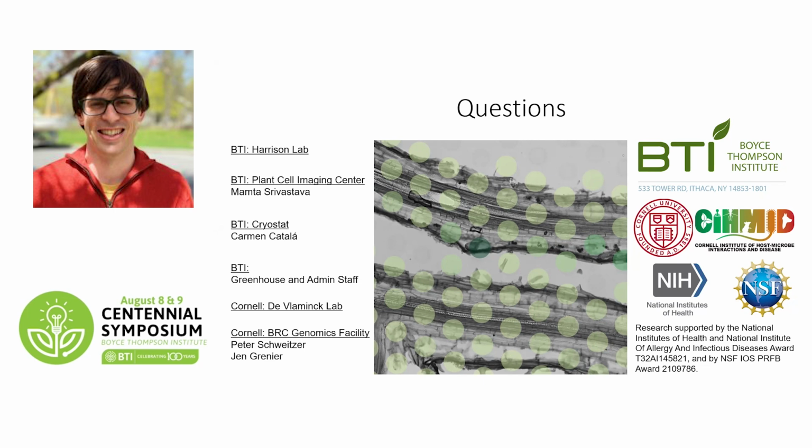Yes, so there are changes that we can observe because we have the single nuclei maps too. And you can see the changes that are occurring in the stele and the phloem and xylem, for example. We have lists of genes that are changing in the endodermis. And then it's a little difficult teasing the epidermis and the cortex apart, but there we have some modules that are clearly being upregulated in the epidermis of colonized cells, which are interesting.